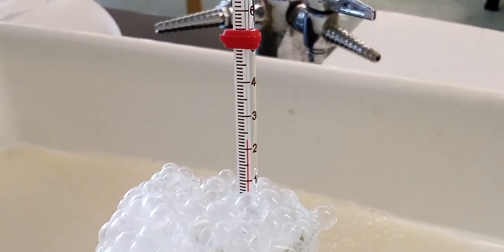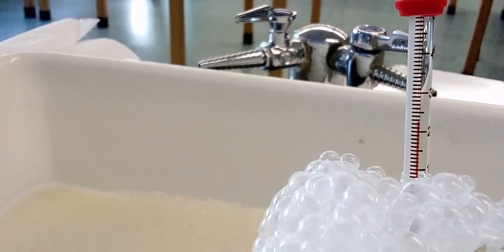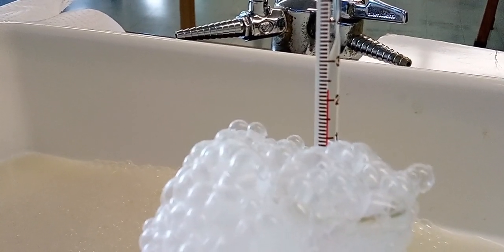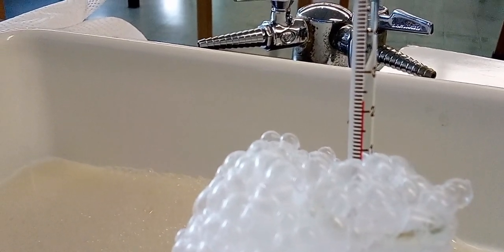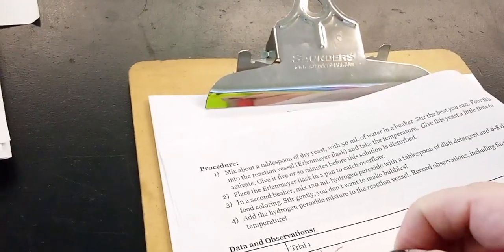I don't think it's going to increase more. So the temperature is going to be here: 20, 21, 22, it says then 23, so 22.5. So the temperature is 22.5.